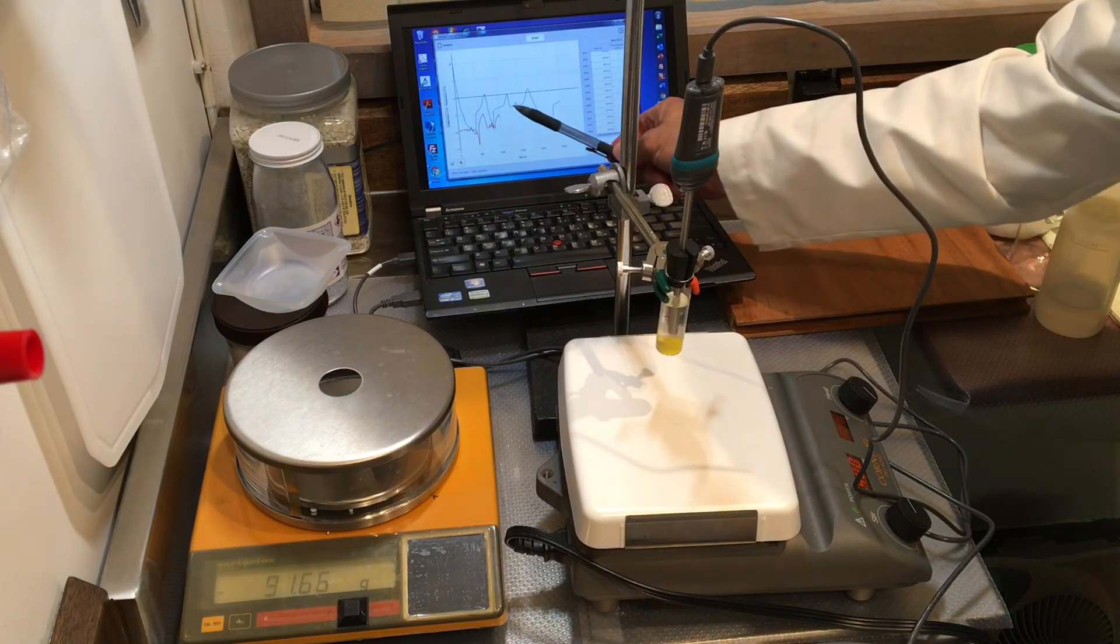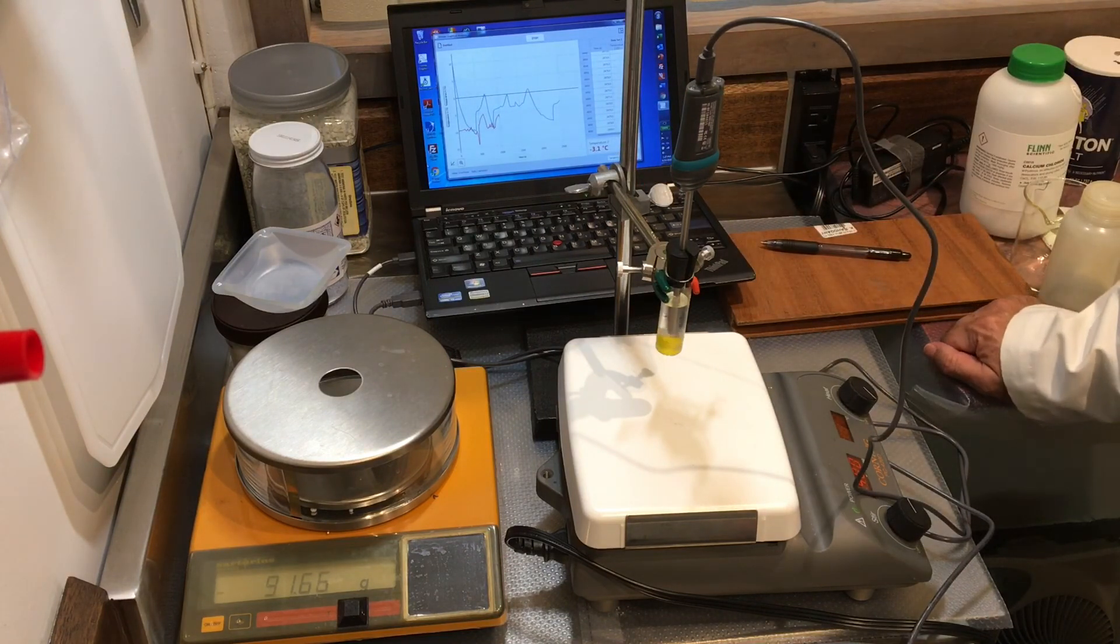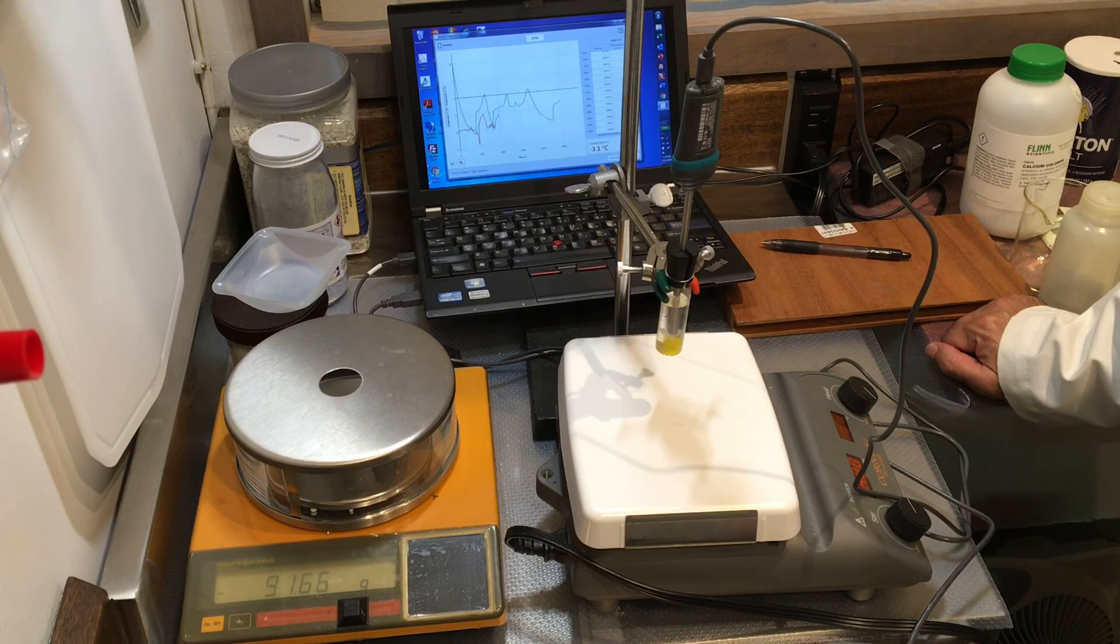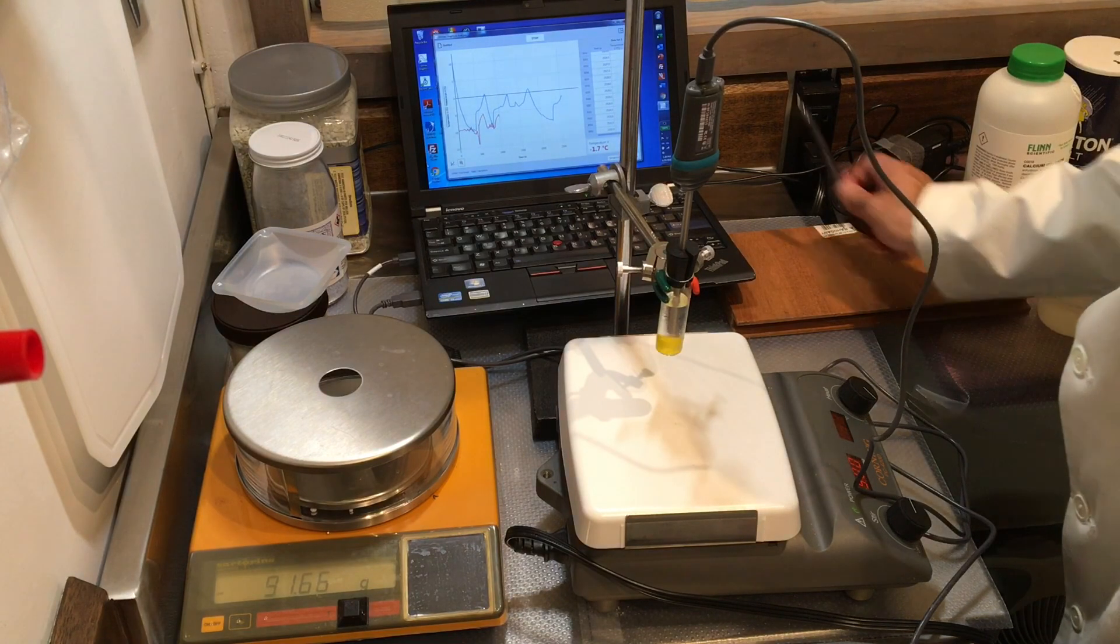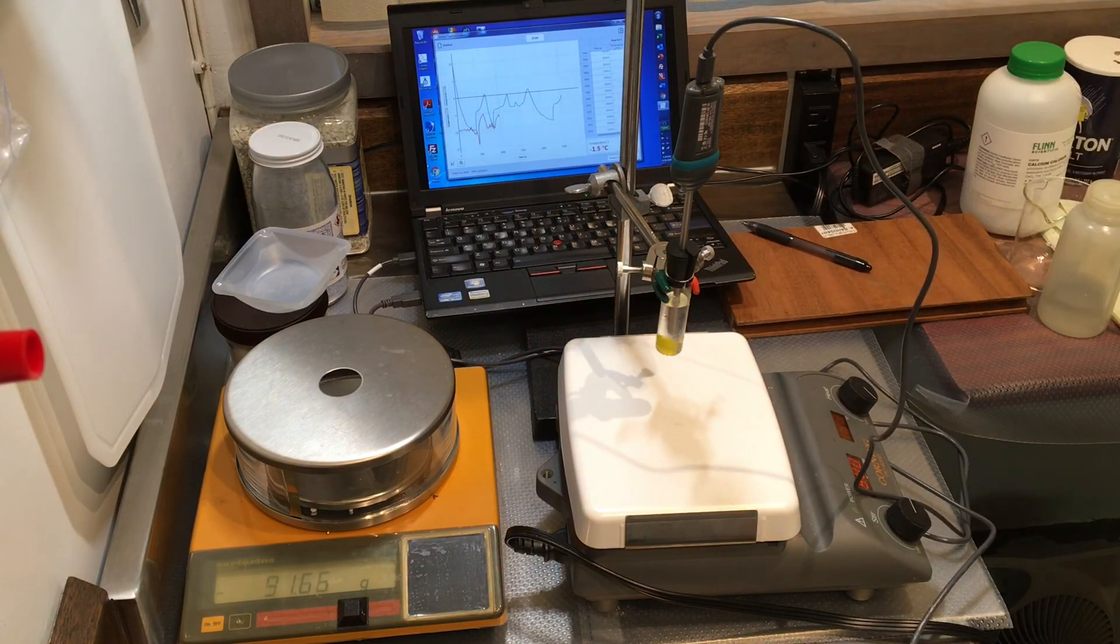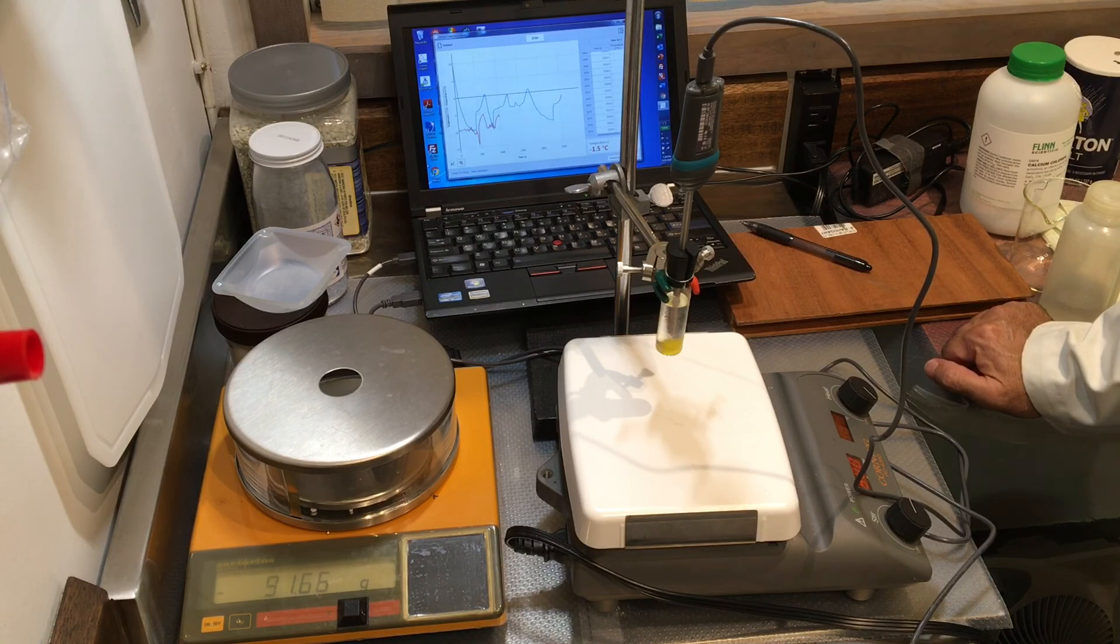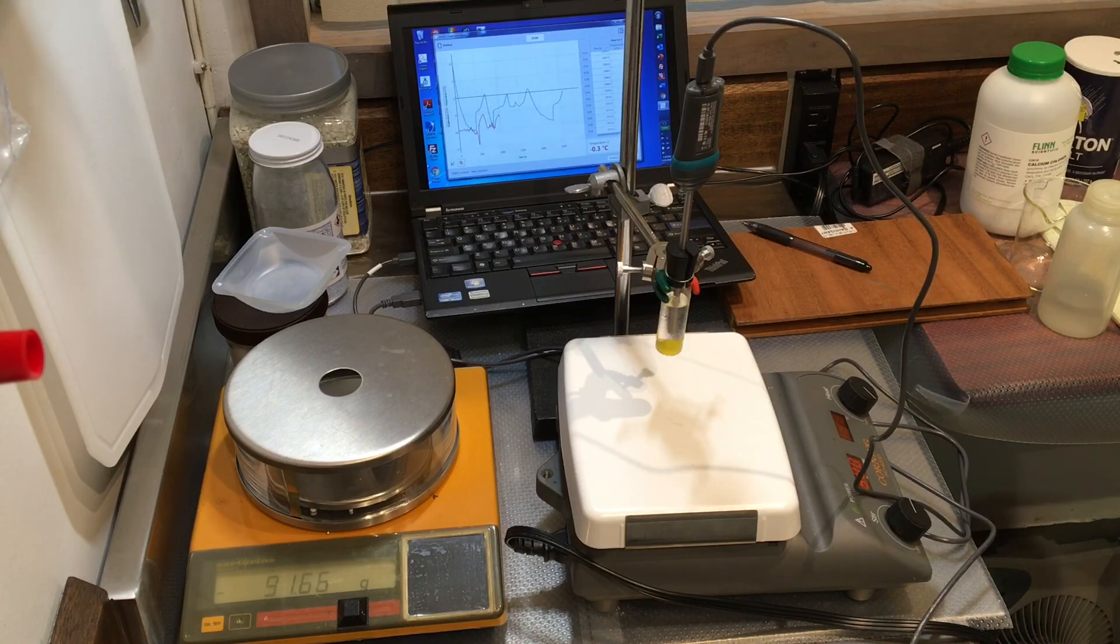It looks like it wants to do this dip here, this peak there. It looks like what happened here is a copy of what happened in Trial 1. That's it for now. Let's check that out.